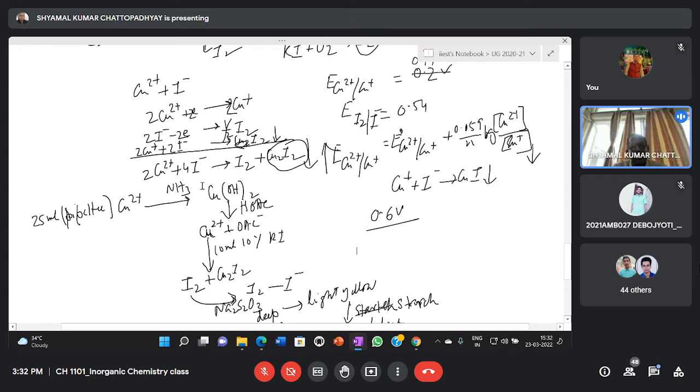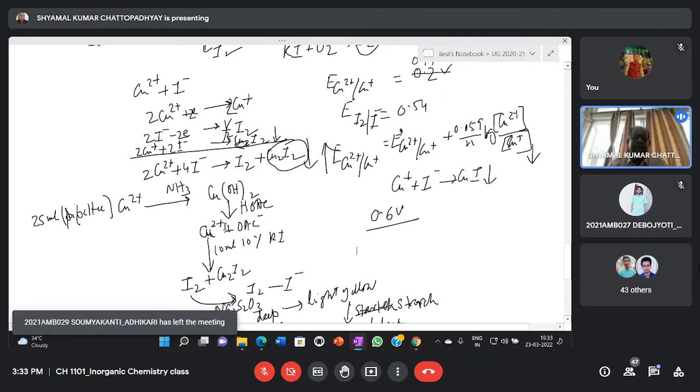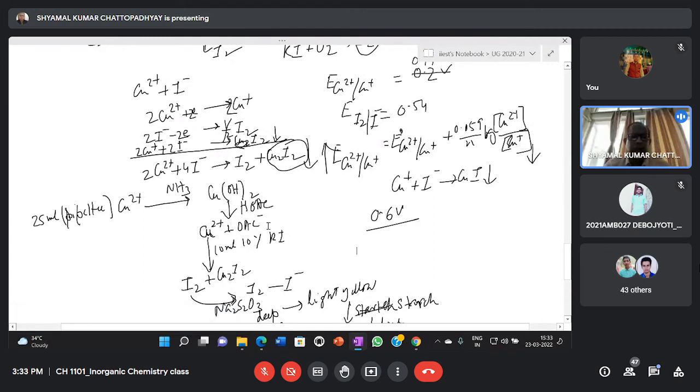Right? This cupric hydroxide will be precipitated. Remember, if you add excess ammonia, then this precipitate will dissolve and it will form a cupramine complex. So you have to take certain additional precautions. Try to avoid adding excess ammonia. Then add your acetic acid, right? Add acetic acid drop by drop till the precipitate completely dissolves, and then add 2 to 3 milliliter acetic acid in excess, so that you have cupric ion in weak acidic medium, cupric ion and acetic acid.